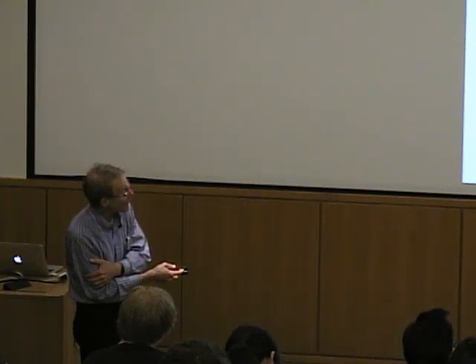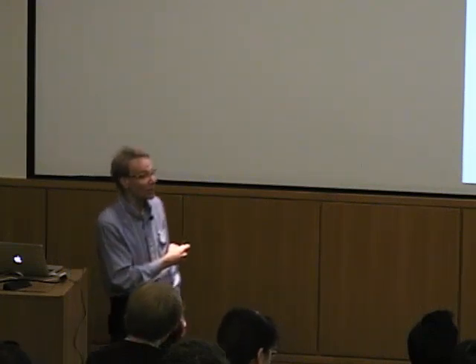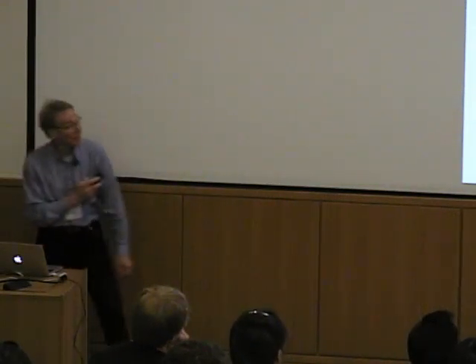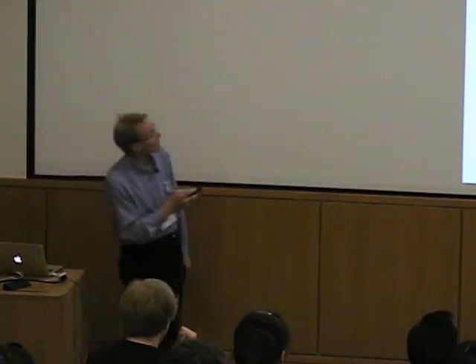We get a binding constant of about 8 times 10 to the 11th. Now the difference here is about 2 orders of magnitude. So we know that this is the last lead that's taken out. That's bound most tightly. So the others, in fact, are bound less tightly by about 2 orders of magnitude. So that's how we can kind of estimate what's going on in this case. The analysis is a little bit tricky.